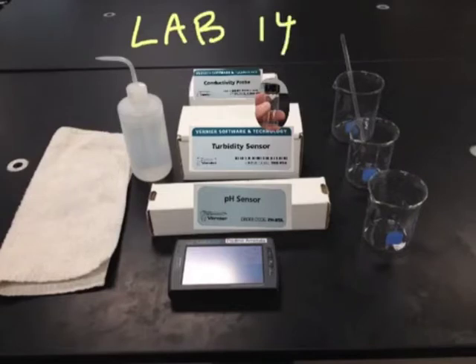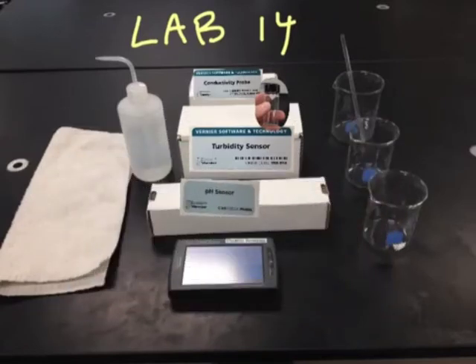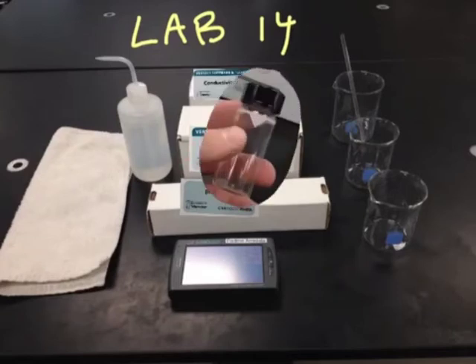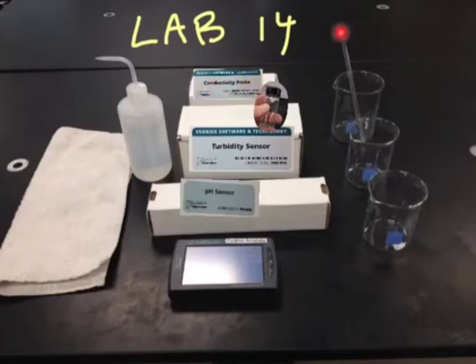The equipment you're going to need for this lab: you'll need a towel, a water bottle with distilled water, and a LabQuest with three different sensors — a pH sensor, a turbidity sensor with a glass cuvette, and a conductivity probe. For glassware, you'll need three beakers: one 400 mL beaker, two 250 mL beakers, and a glass stir rod.